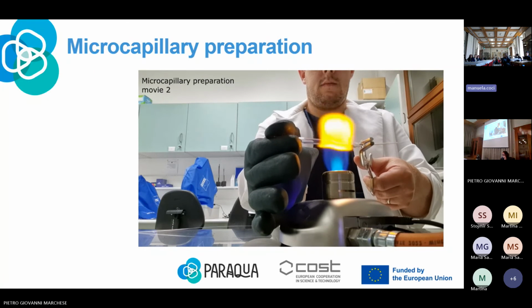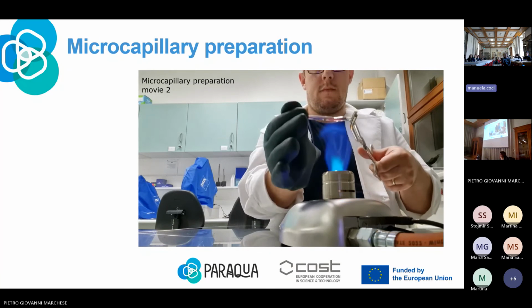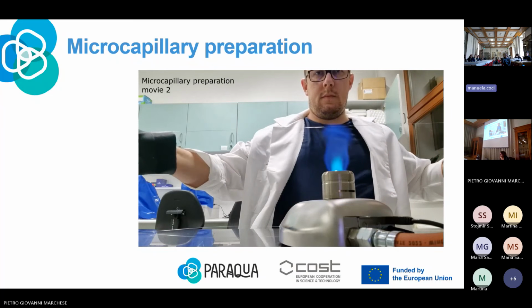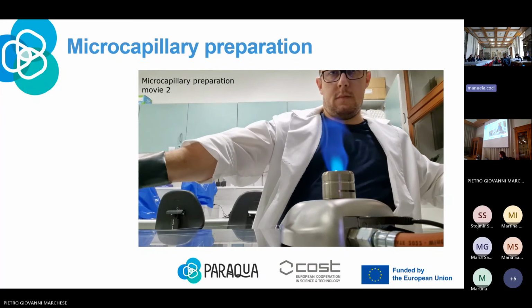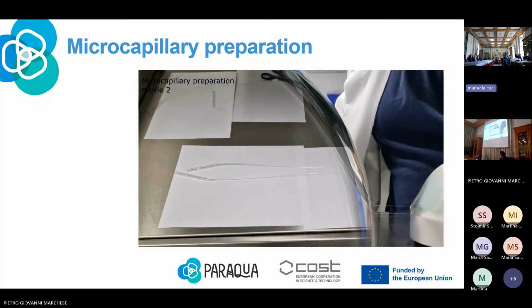And after several transfers of the specimen through the drops of media, we have a chance to get a quite good isolate.